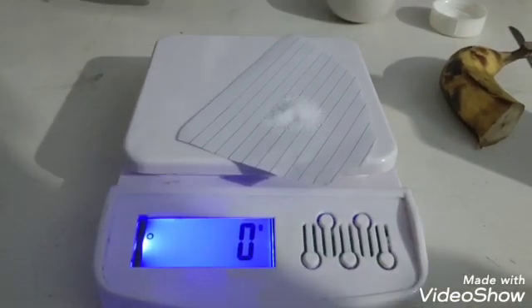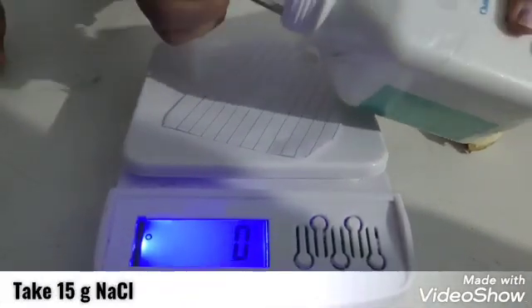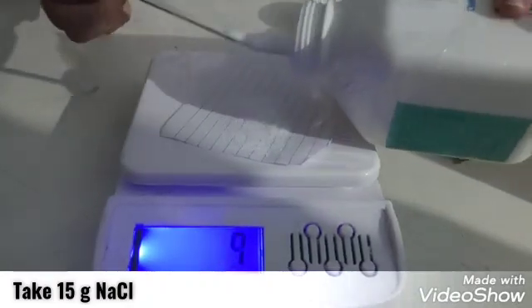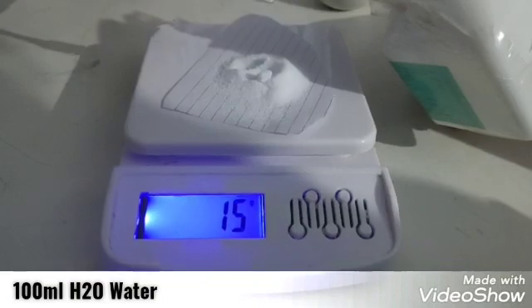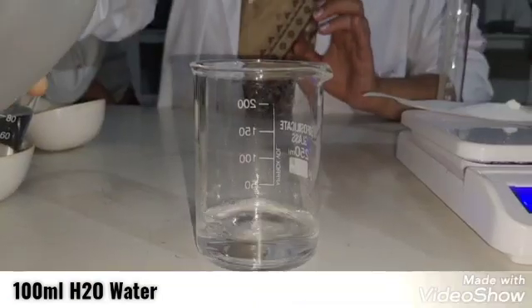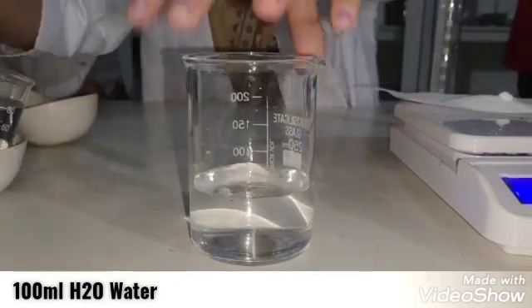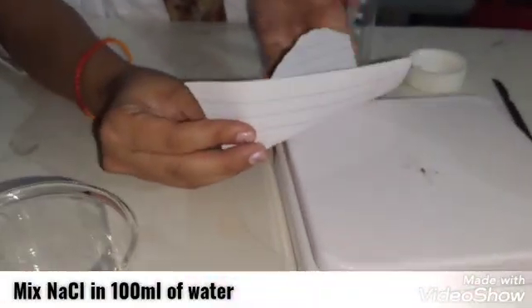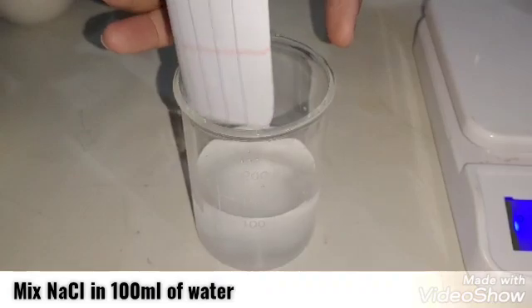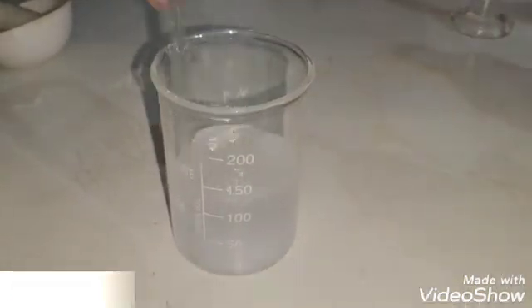Now, in a measuring machine, take 15g of NaCl. In a beaker, take 100ml of water and add 15g of NaCl into it. Stir it well with the help of a glass rod.